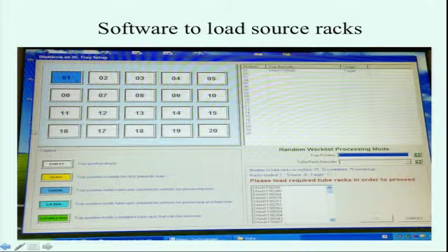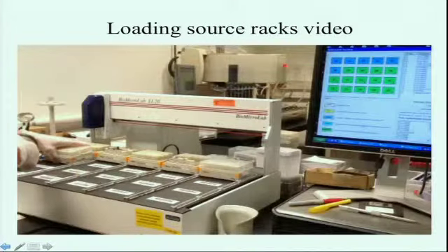And also, to build in some redundancy and to minimize some errors, we have Robofiles that we've generated using the web tools or manually. And we also have software that we use to track the destination plates that we can load on, and also the list of source plates that's required for each rearray. So we like a lot of redundancy, a lot of ways that we can automate everything to minimize as much human error as possible. Because if you're pulling out such a huge amount of piles of racks, how do you know that this is the correct one you need? You're not going to be looking at the whole list and say, yes, this is correct. So we like a lot of redundancy built in. And here I can just play a short little video.